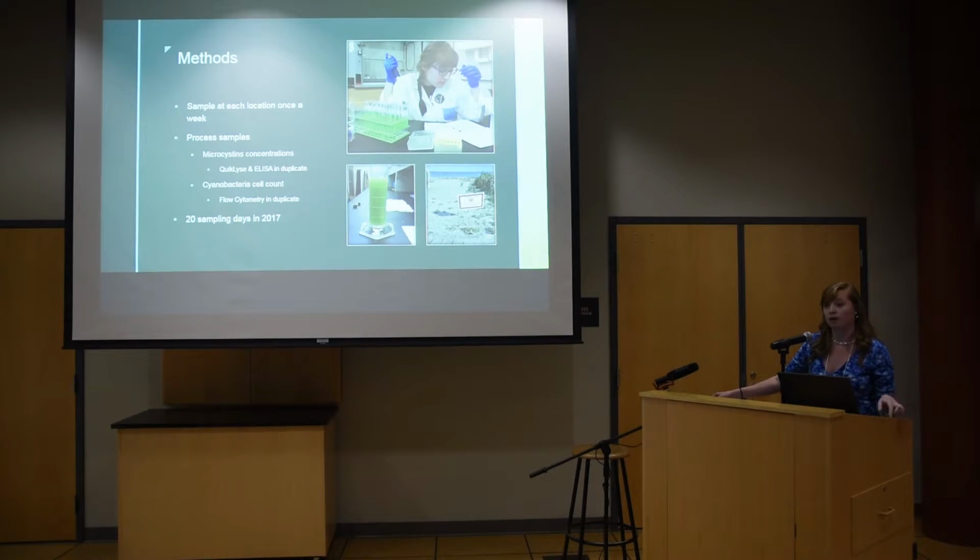We actually did 21, but we only did 20 sampling days where we processed both toxin concentration and flow cytometry for the cells. And this is one of our interns, Julia Guerin, doing an ELISA test over the summer. She was learning, and she did a very good job.